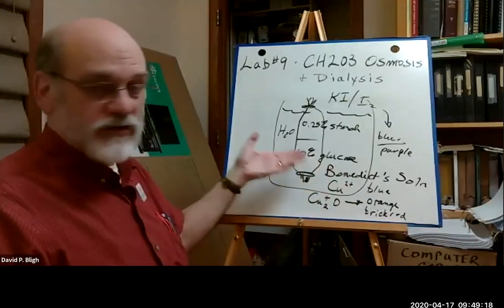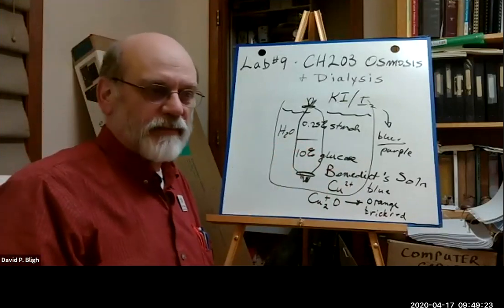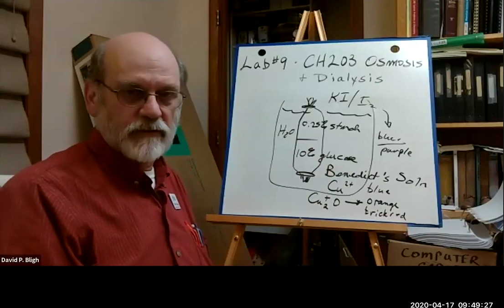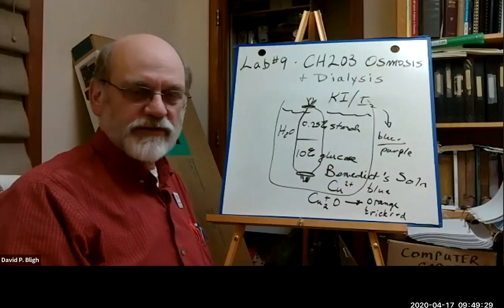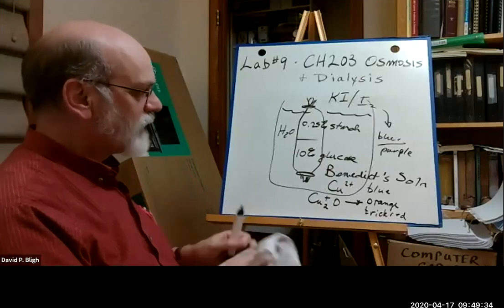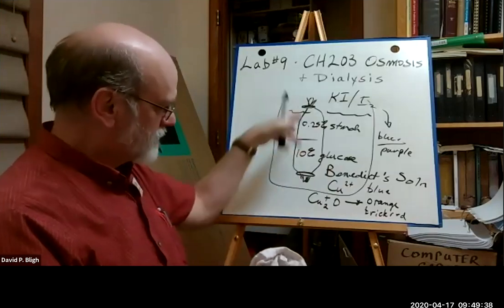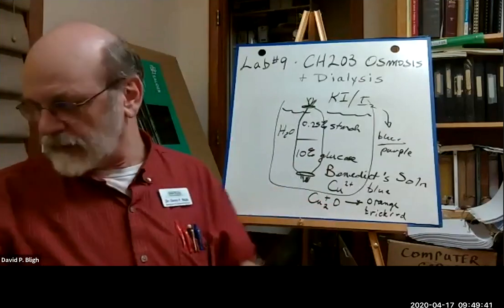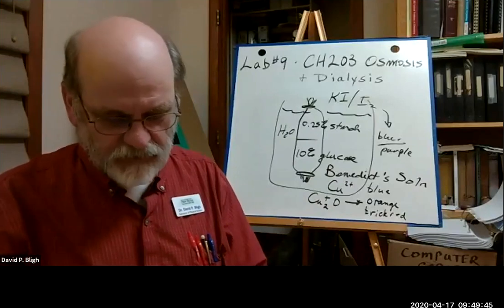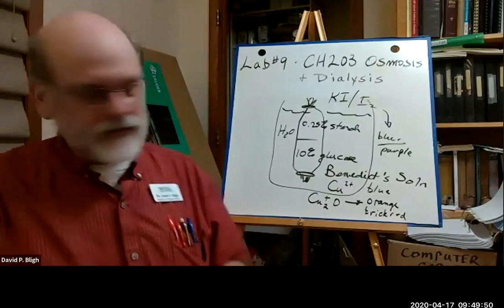So we could use other sugars than glucose, but since glucose is a physiologically important sugar, it makes sense, right, for chemists to give a head nod to physiology. Right? So that's going to be our dialysis test using this dialysis tubing. Okay, so read the method and you'll get more details about that process.